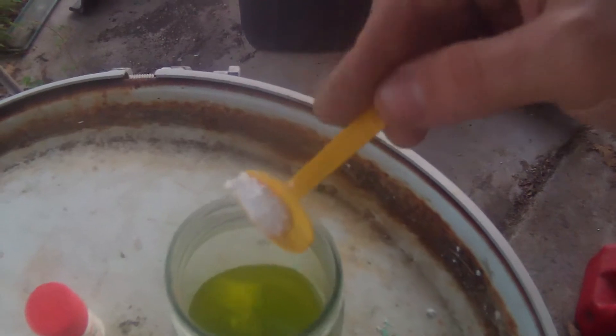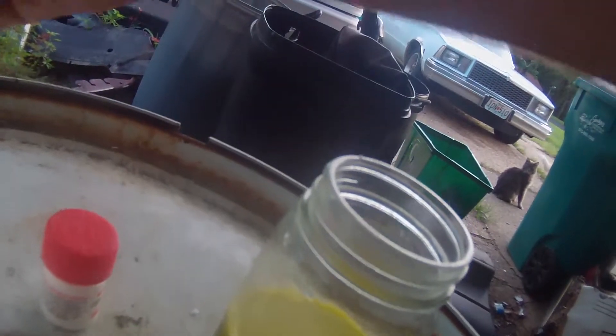You'll notice as we sprinkle it in, it starts to react with the acid. You'll notice that the solution is getting darker, and as it gets darker, that's the gold dropping out to the bottom of the solution. You've got to be careful though — it puts off a pretty nasty chlorine gas.